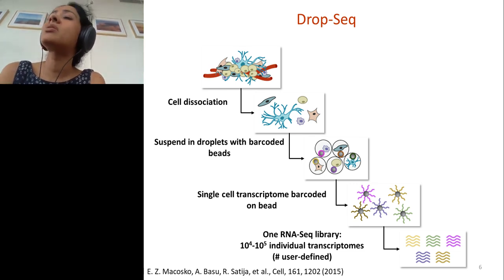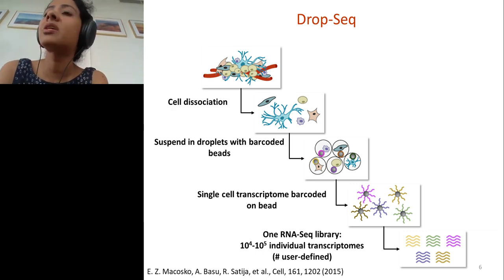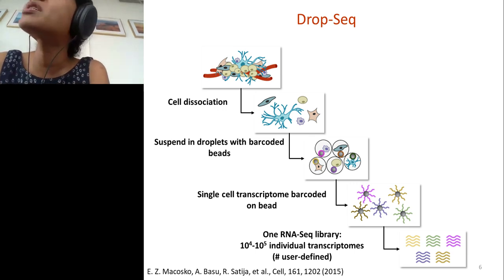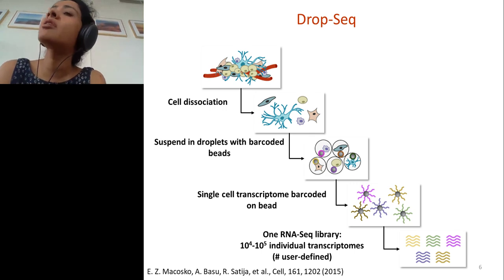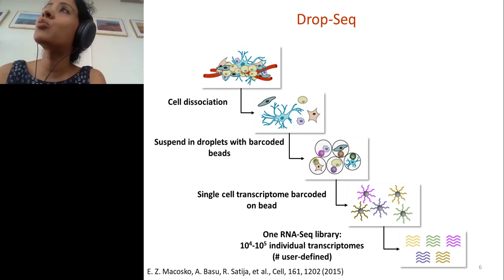And what is going to happen is this RNA, because of the high concentration of molecules in a droplet, is going to find DNA barcodes that are attached to the beads and come to the poly T section that I had shown you before. So the end result is we are going to sample the mRNA from a given cell using these DNA barcode beads, such that a fraction of the mRNA is hybridized onto the bead. Once this happens, we can then break the droplets.